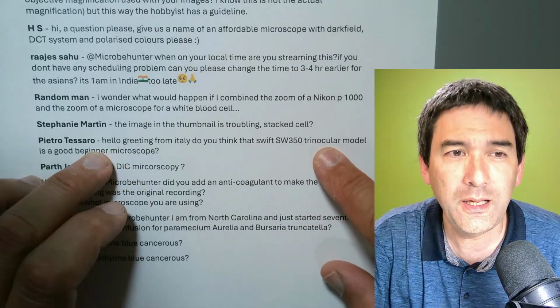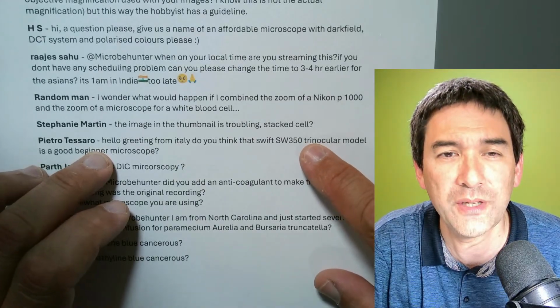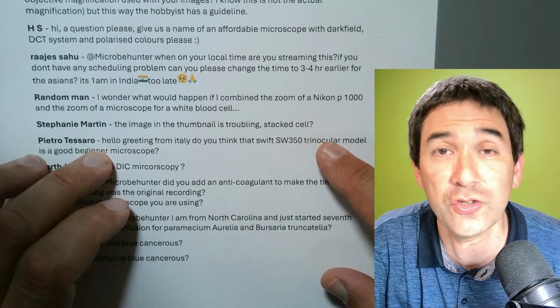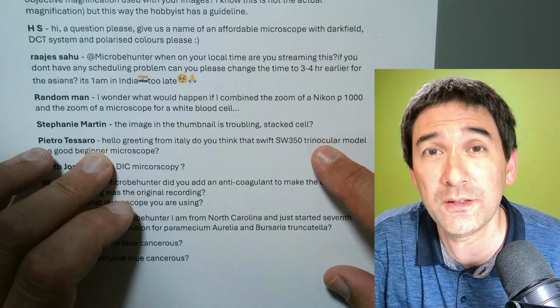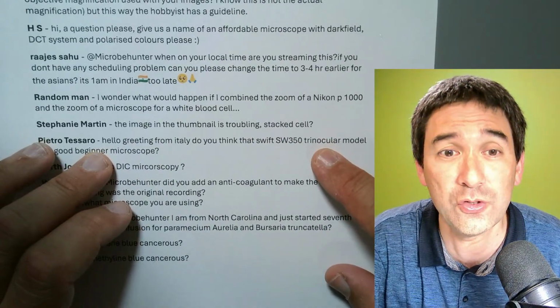You see, again, I don't know. I think it's the one with the condenser. I think, why not? These are just standard microscopes, and my general suggestion is start with a low-cost microscope, experiment around with it. You're going to outgrow it maybe, right? Then you can always get yourself a better model.